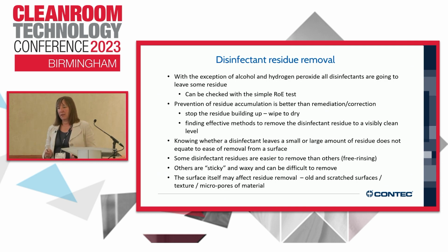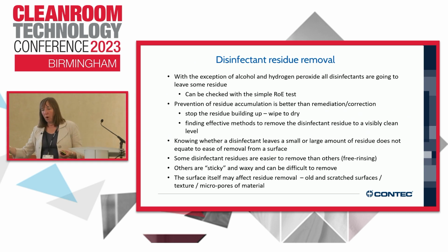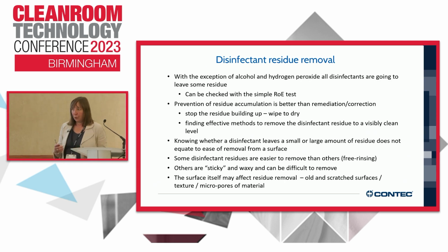The best thing to do with disinfectant residues is stop them building up in the first place. So once you've allowed the contact time, if the surface is still wet, wiping or mopping to dry is the best way to make sure you don't get a build-up. If you do get a build-up, it's best to solubilize it first and then remove it with a dry wipe.